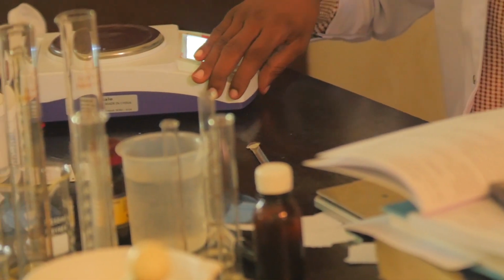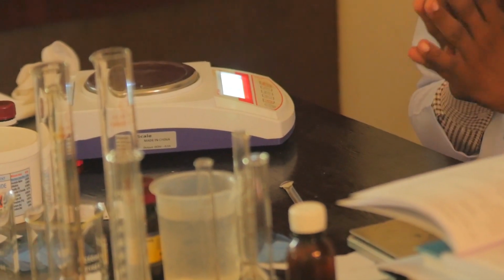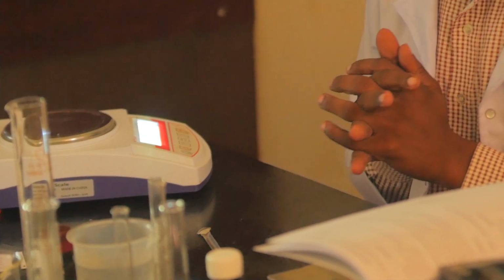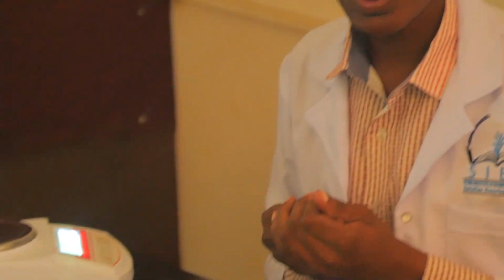So what follows next is to measure liquids. Now we were weighing solids, now we are going to measure liquids. The amount of water to be used should be the same as the amount of potassium iodide, considering the solubility of 1:1. So at first I used 0.5 grams of potassium iodide.